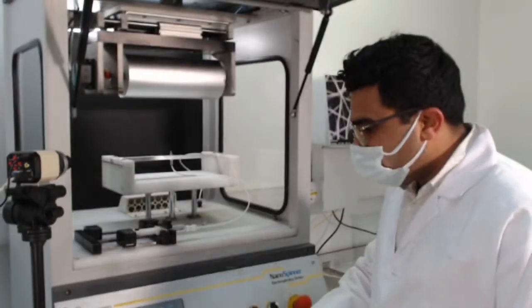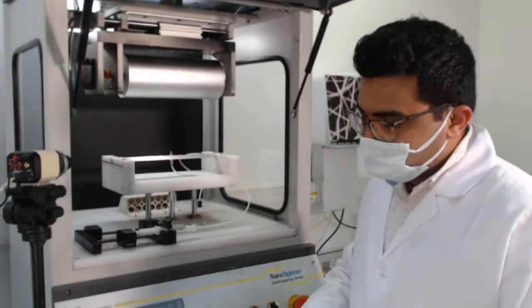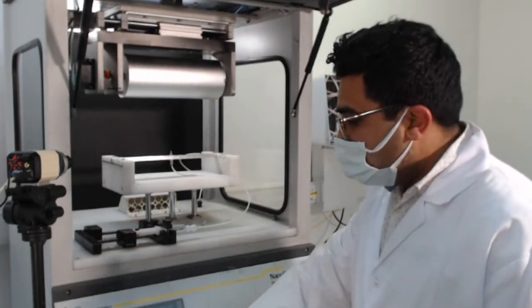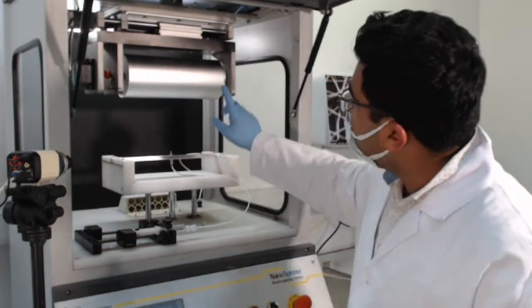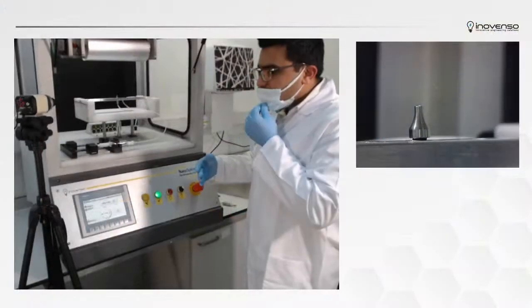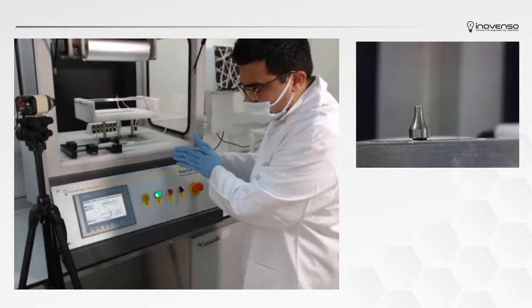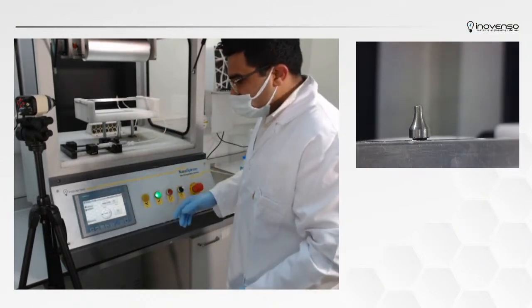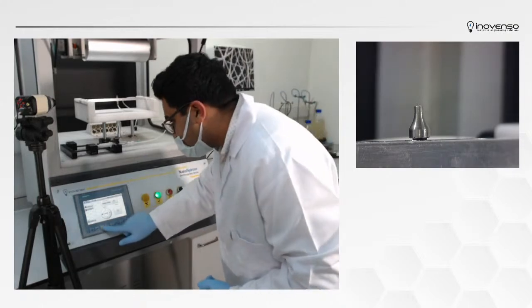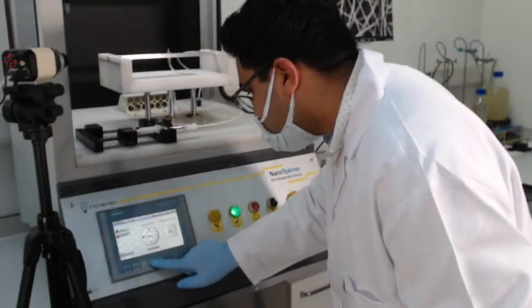Like we mentioned earlier, high voltage is key, but since it's one of the most dangerous parts, we're going to run it at the end. Since we're using a drum collector, we're going to go to the collector option here, where you can set a particular RPM and homogeneity, and associate what distance it will be. So let's go to the distance.